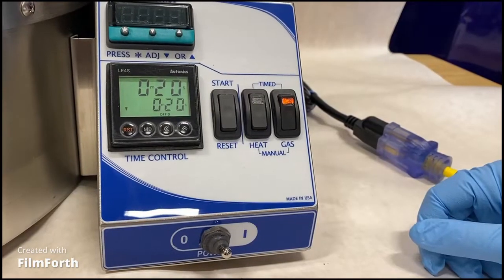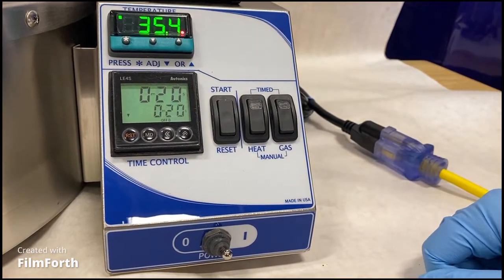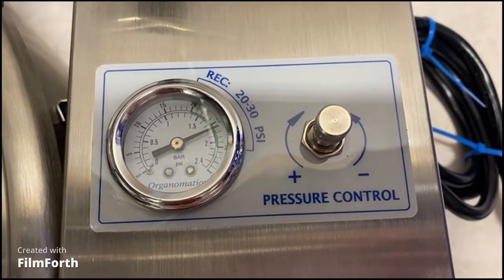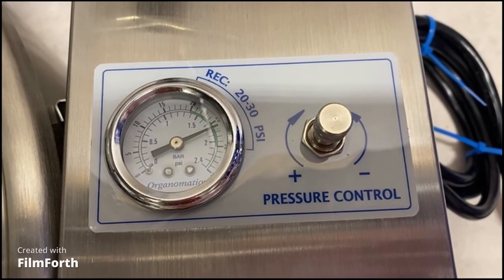To check the instrument's built-in pressure regulator, turn off the gas switch but leave the gas source on and connected. If the pressure gauge reads between 20 to 30 psi, the regulator is working. If not, it may need to be adjusted.